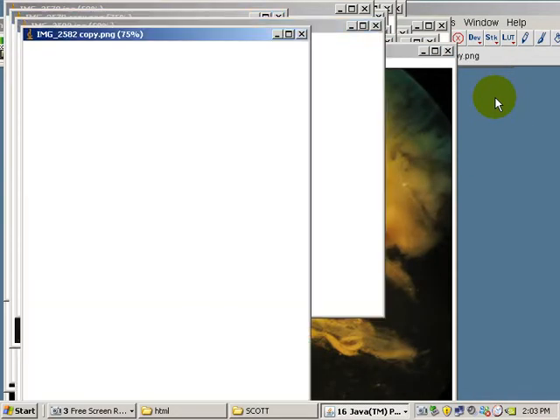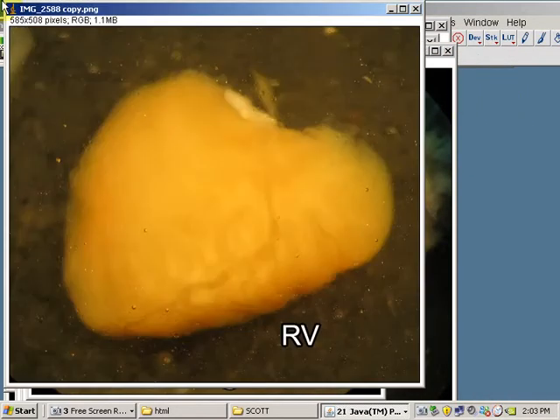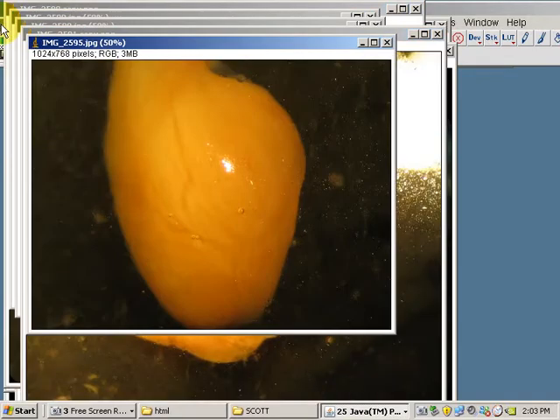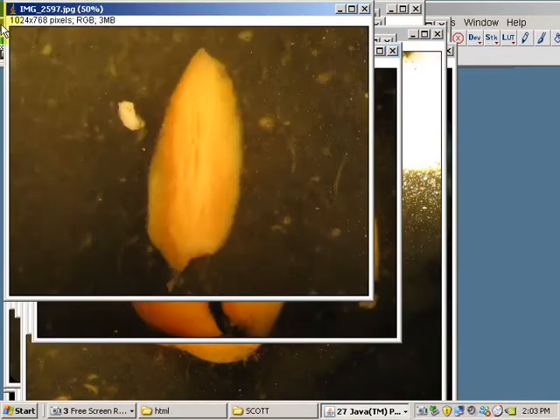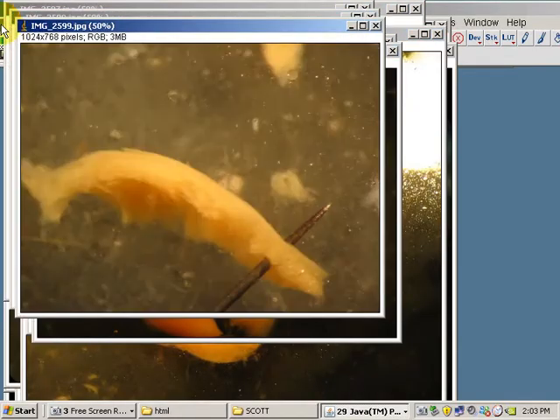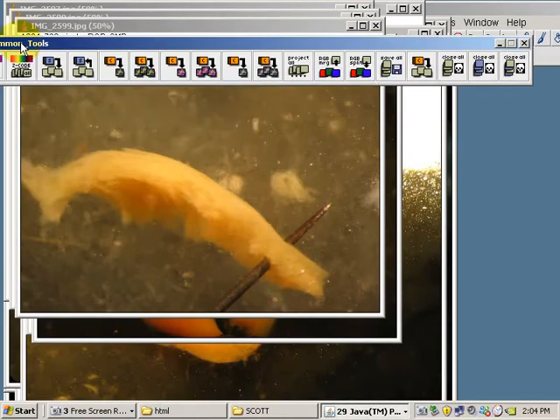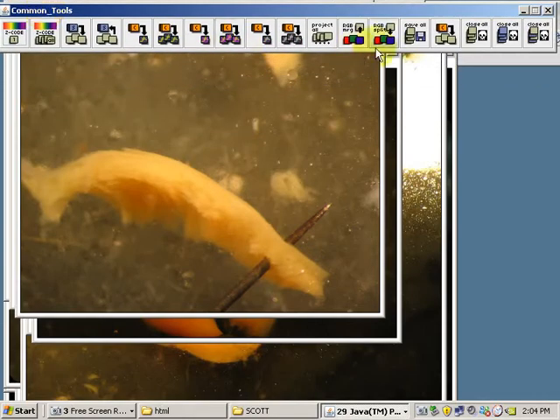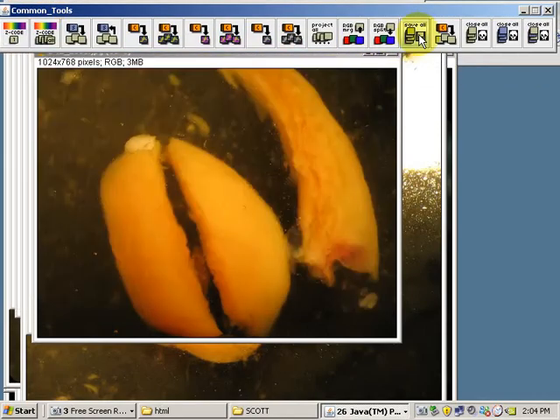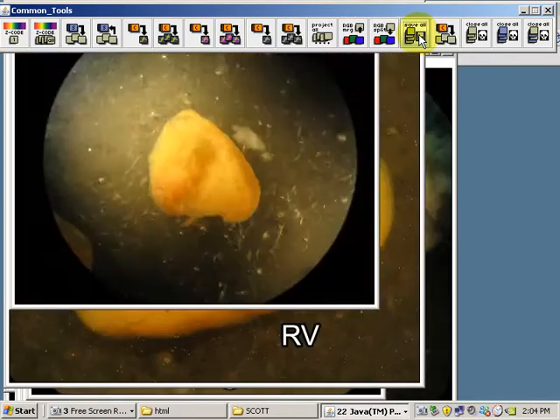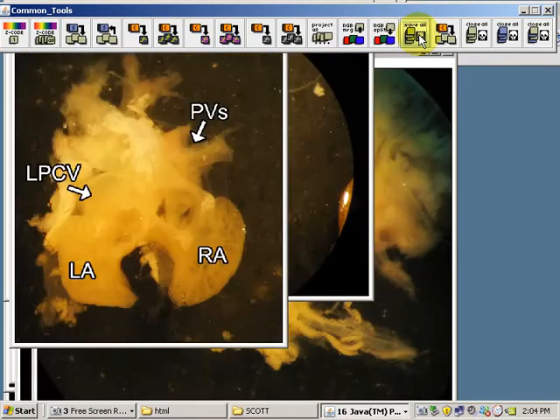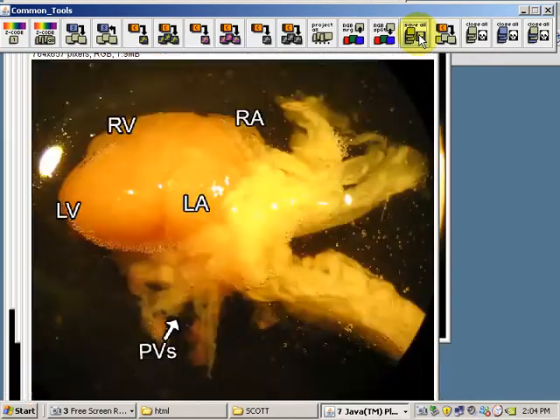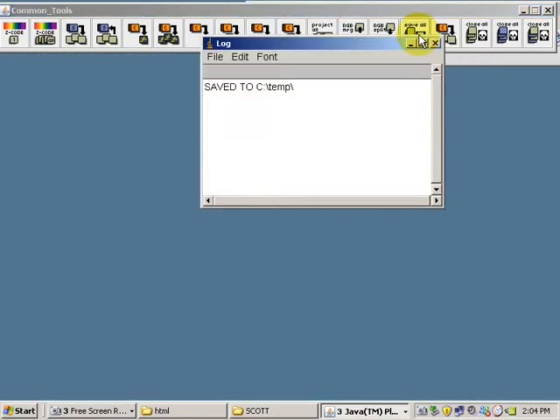Now that they're all open, I can go to the Scott Bar and click on Save All. And it will save all of them one by one as a JPEG file, no matter if they're originally JPEGs or PNG files.